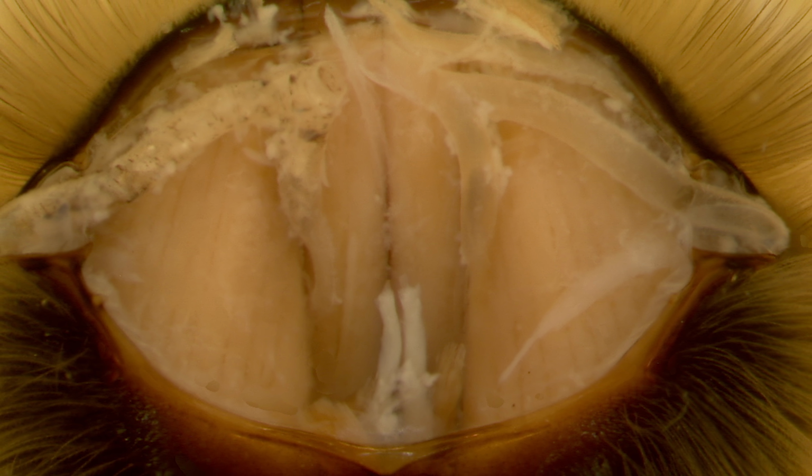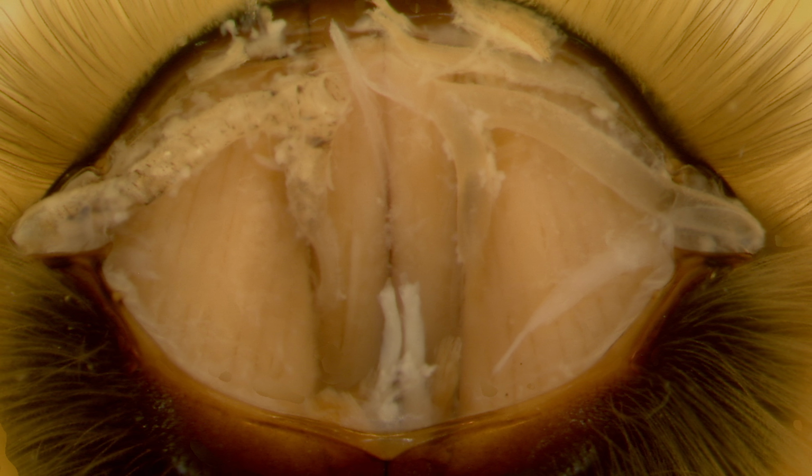So you can see these tracheal tubes that are filled with these globular structures. Some of it's white. It looks completely clogged in heavily infested situations, or it might only have one or two of those oval-shaped structures at the tips of the tracheal system near the spiracles. Once tracheal mites have been in there for any length of time, they cause feeding damage that can cause the bee's body to melanize the tracheal tubes. Melanization simply means that they turn black. So if you have tracheal tubes that have these white globs in them or this black melanization, then you know you've got a tracheal mite infestation.